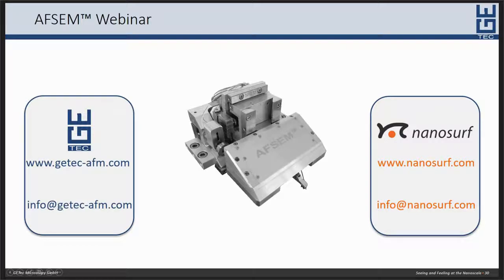The phase gives you information on the energy dissipation of the cantilever when it taps on the surface. So the phase might give you information that you have a different phase, let's say tin oxide or tin, and you might see a difference in the phase there, although you do not see any difference in topography. So it might be possible, of course, yes, but it depends on the sample.